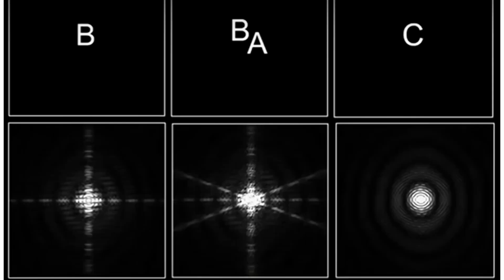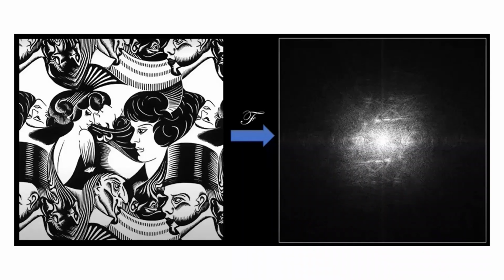Light diffracted from a point passes through the Fourier plane to form diffraction patterns. Undiffracted direct light, or zero-order light, falls to the centre as a bright spot. Usually, in symmetric illumination, the pattern forms with a mirror image in the opposite half of the circle.